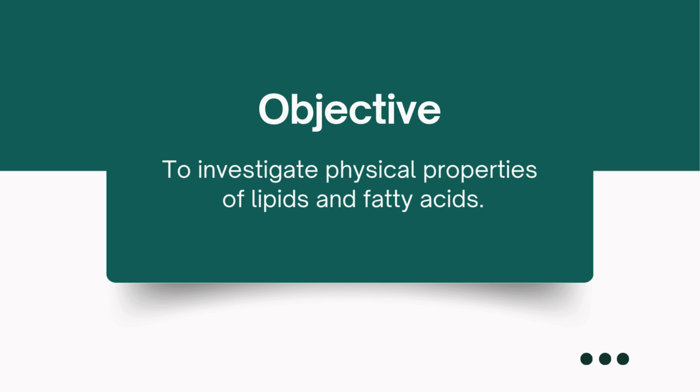So what is the objective of this experiment? The objective of the experiment is to investigate the physical properties of lipid and fatty acid.